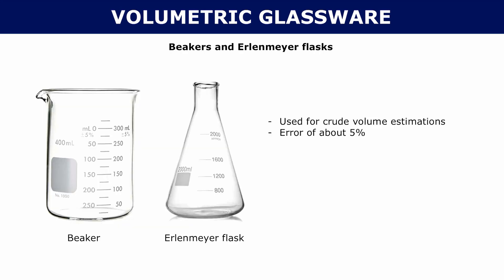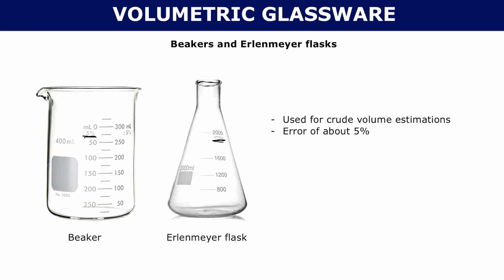Let's take a look at beakers and Erlenmeyer flasks. This is what they look like. The reason that they're not considered volumetric glassware is because they're only used for crude volume estimations. They have a pretty high error percentage, about 5%. You can see them on the side, they're marked. In the Erlenmeyer flasks, you have an approximation here. And in the beaker here, you have a plus or minus 5%. This error might seem kind of small, but in the world of chemistry, you want to be really precise.